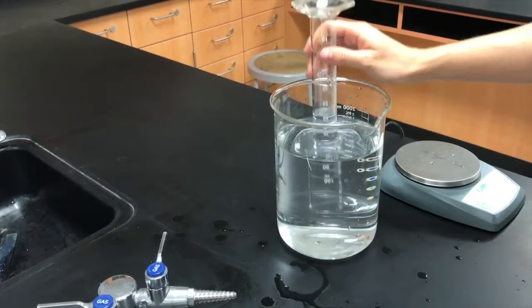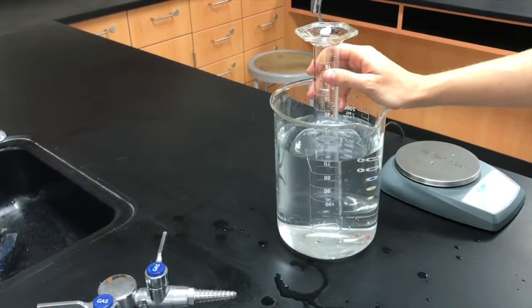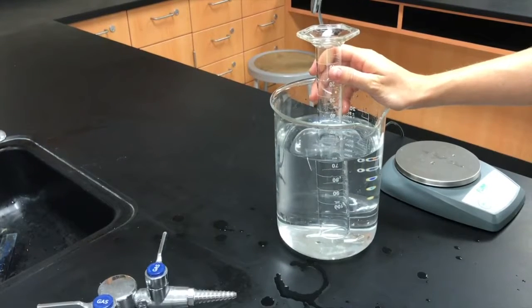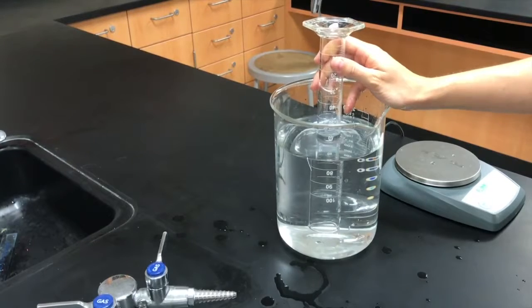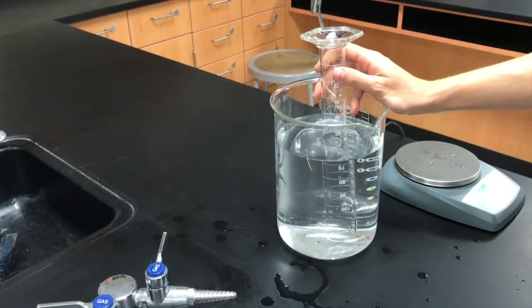So I've noticed that the volume changes slightly when I move it up and down just a little bit, okay? So once I have the levels of the water lined up, then I can measure the exact volume of gas, of butane, that is in here. So right now this is almost exactly 60 mL. Okay? It doesn't have to be exactly 60 mL, that's fine, but somewhere around 60.